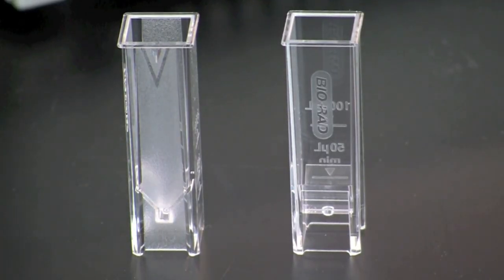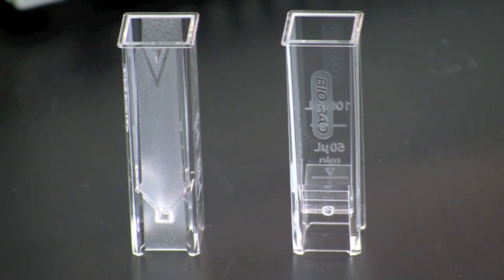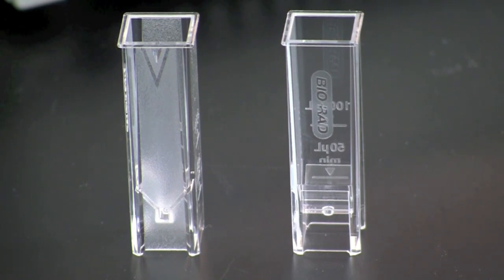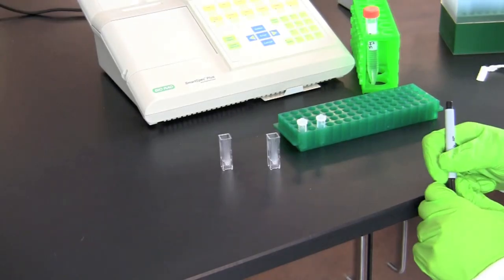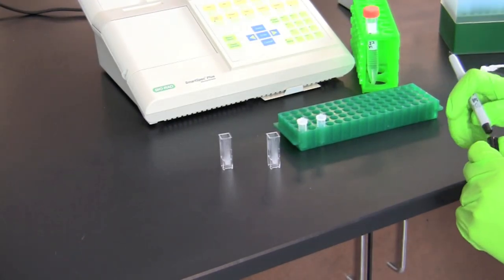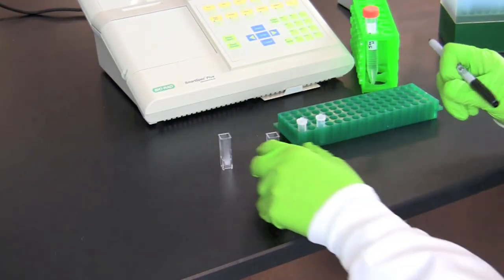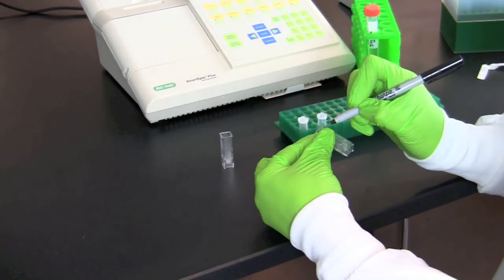You will need two cuvettes that are transparent to UV light. When handling the cuvettes, always place your fingers on the opaque side and not on the transparent surfaces of the cuvette. Label one of the cuvettes C for control and the other cuvette will be your test.